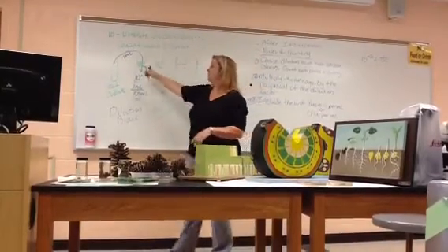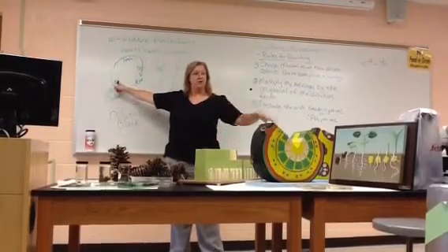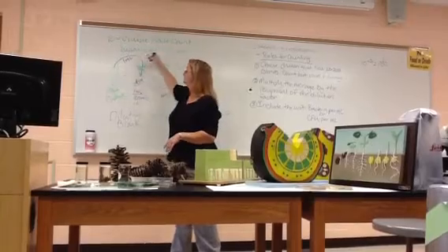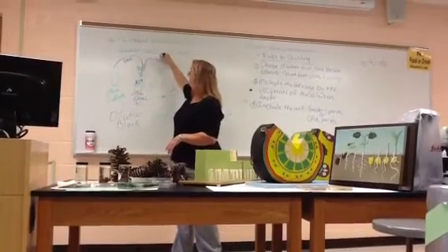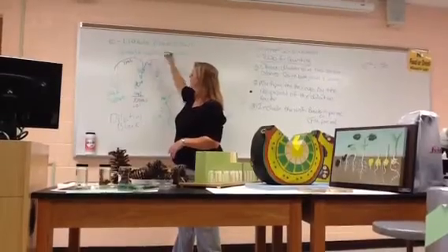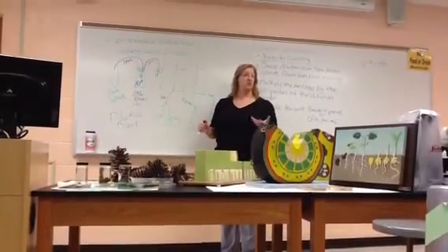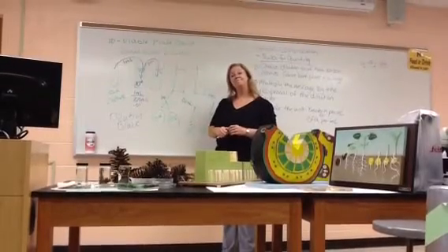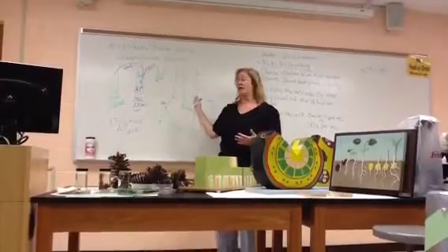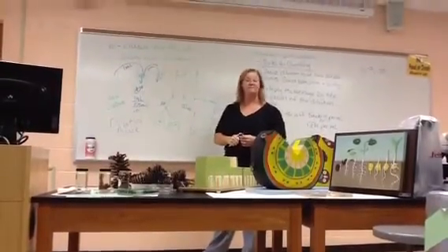Get rid of that first pipette because it was in the stock culture that had 1 trillion bacteria in it, so it goes in the biohazard bag. Get a clean, sterile pipette, and now move a ml of liquid from that first dilution into a second dilution blank, a second sterile bottle that has 99 mls of water in it. So don't go back to the stock culture. We're doing serial dilution here again. We're using one dilution to make the next, just like we did in Lab 9.